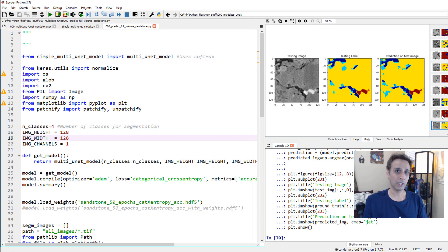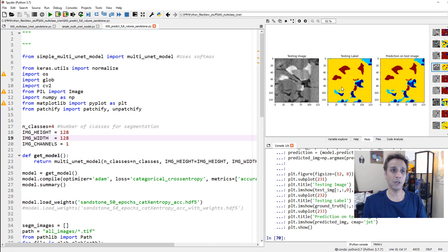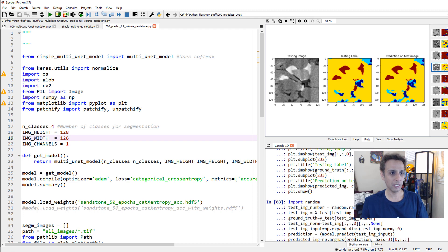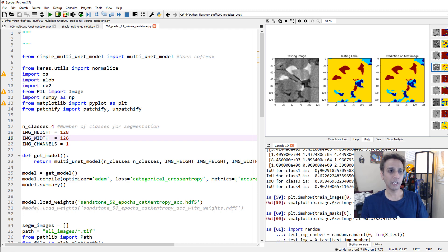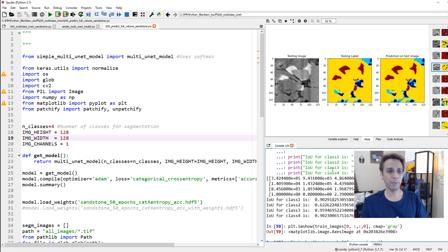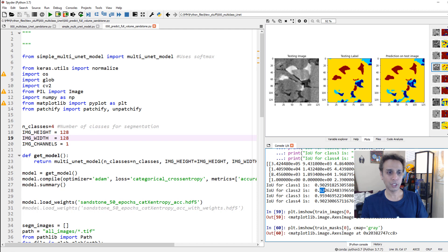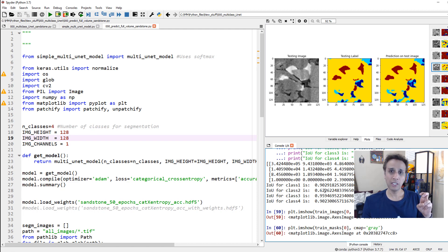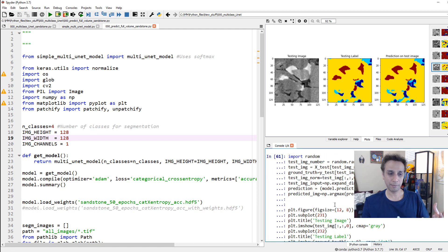Here is where we left off in the last video - we were looking at some segmented images and realized our model is doing an amazing job, including IOU values of on average about 80 to 85 percent. For class 1: 90 percent, class 2: 62 percent, class 3: 96 percent, and class 4: 90 percent. For class 2, I tried random forest, gradient boosting, UNet, and a bunch of techniques - 62 percent is as good as it gets. We could have played with weights but let's accept this model.